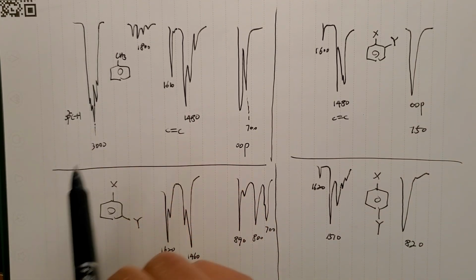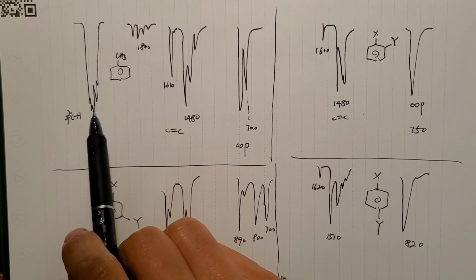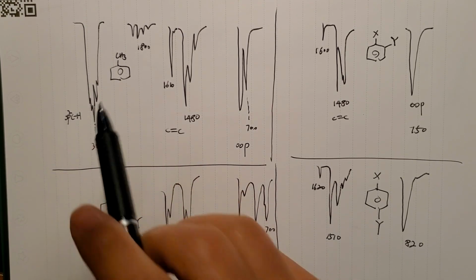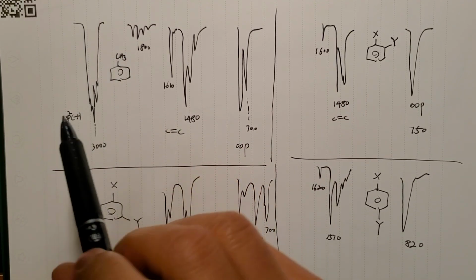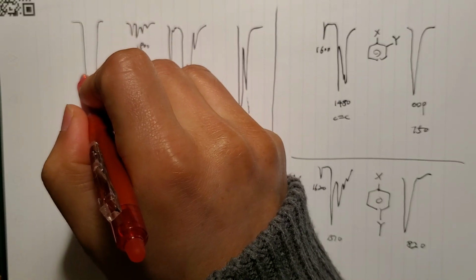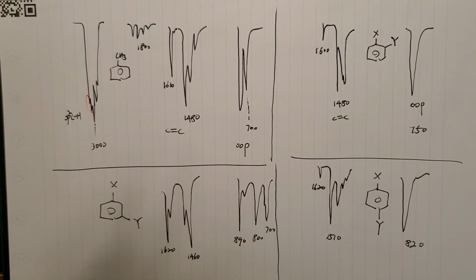And this area 3000, right? You have sp3 3000, a little less for CH3s. Okay, CH3, no CH2 in this case, but you can have it if you change the R group. But the point is, you are expecting sp2 CH here, and it could be a couple more, depends on how polar the group is, right?